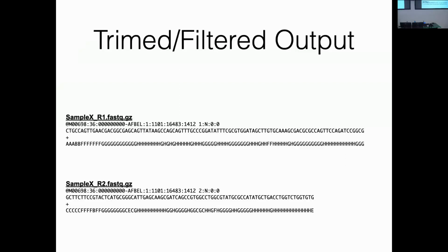So for a 40 base pair sequence, you expect to see it every 4 to the 40th bases, which I'm pretty sure is way larger than any genome. I think that's probably in the trillions at least. Now, again, that's assuming that genomes are random, which they're not.